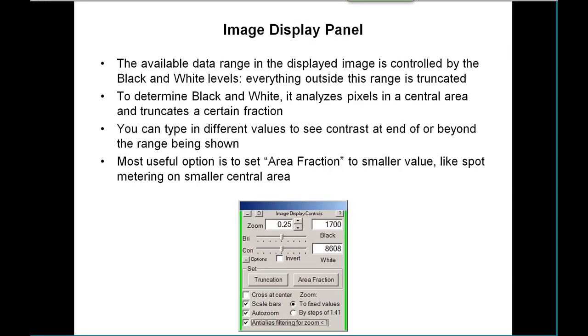Moving down the panels, if you look at the image display control panel, every time you take a new image, you'll see new numbers show up in these black and white boxes. This is the range of data values that are being displayed on the screen as 0 to 255. Everything below the black level and above the white level are truncated at black and white.